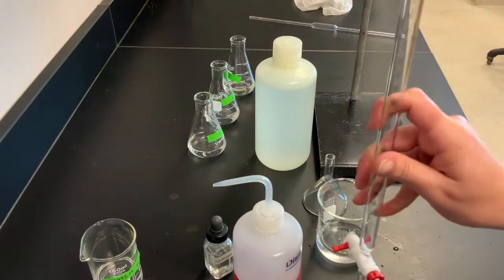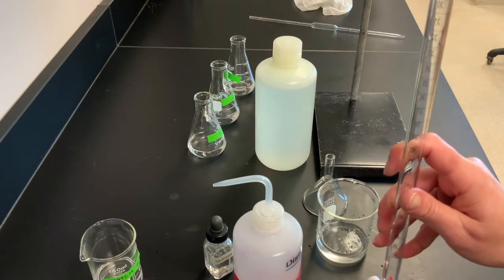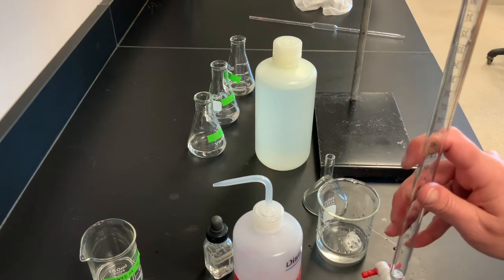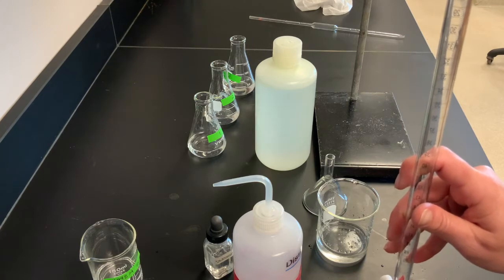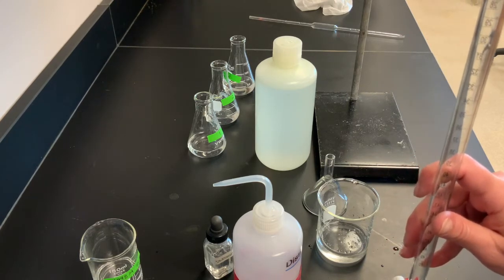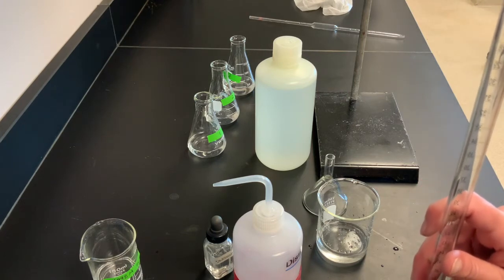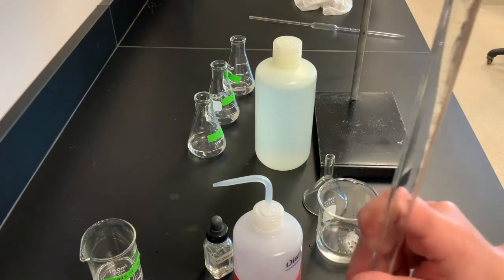So we now have a clean burette. What conditioning does is it's getting rid of that water. We're putting the same solution that we're going to actually titrate with into the burette. If I leave water in here, that's going to change my concentration of my sodium hydroxide, which doesn't help me in determining what's the concentration inside of my container.